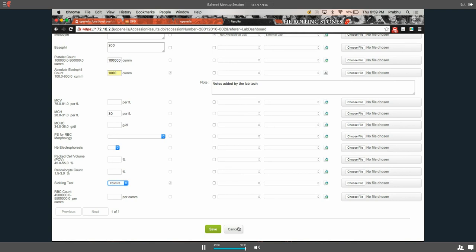It was one of those things I was wondering about, since it happens, and how you would cope with it in this system. And there have been other cases where they want to put in a number that is really small, like less than 0.1, but it actually wasn't 0.